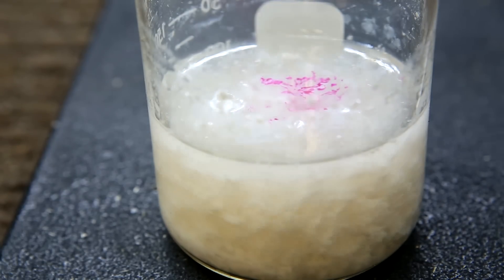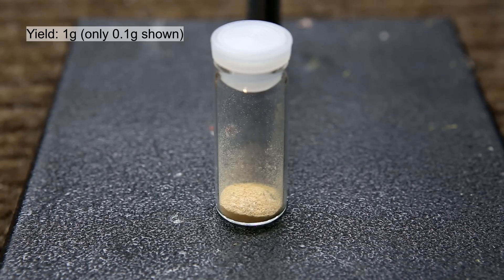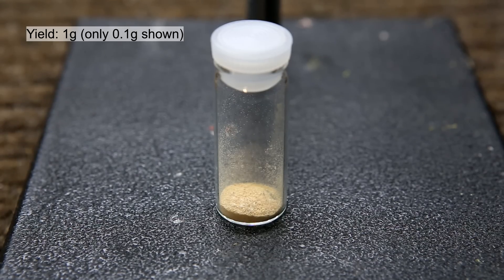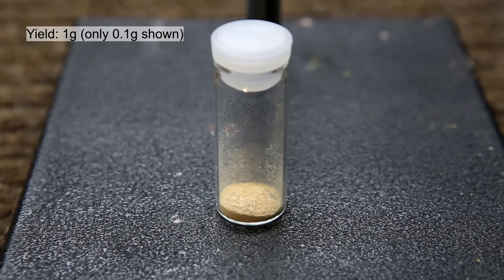This was then vacuum filtered and then dried under vacuum. After letting it dry overnight, I'm not sure why, but the phenolphthalein turned brown. Shown in this video is only about 0.1 grams, but the final yield was actually around 1 gram. So, in theory, you could expect about 10 times the amount that you see here.